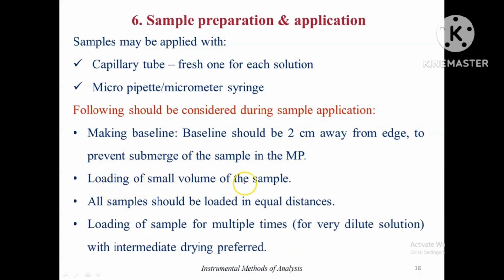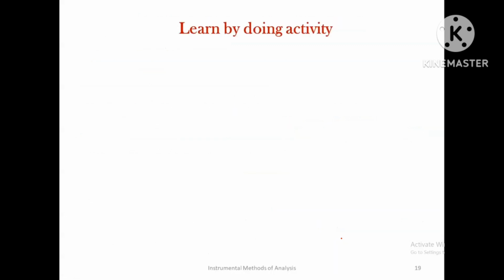Loading of small volume of sample is preferred, and all samples should be loaded at equal distances. Loading of sample multiple times with intermediate drying is preferred, particularly for dilute solutions.